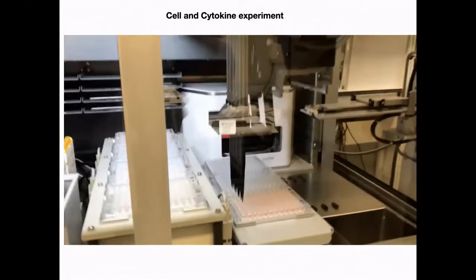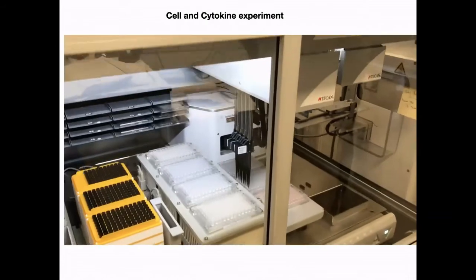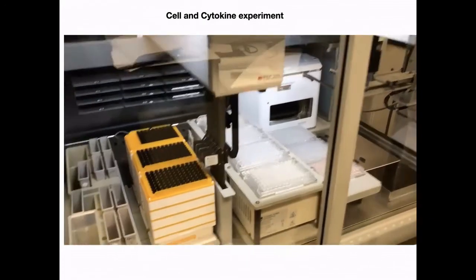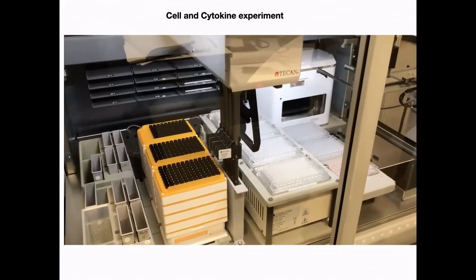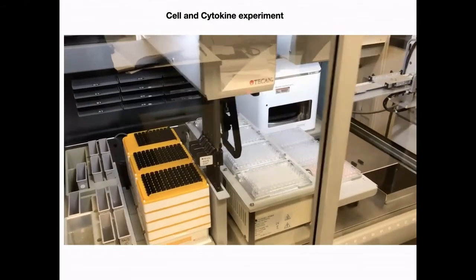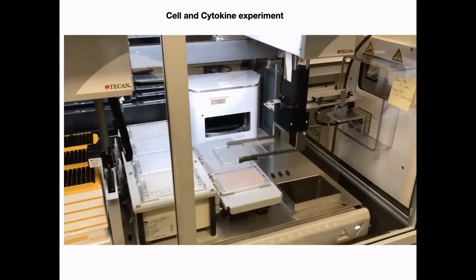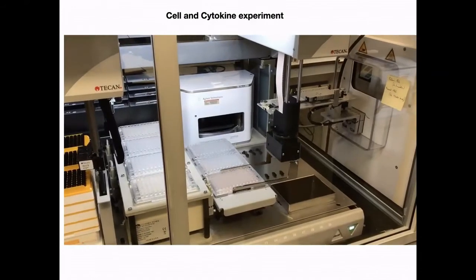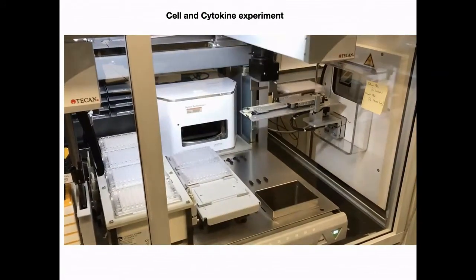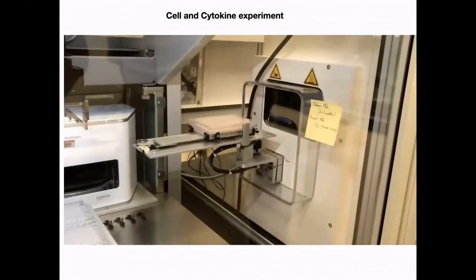And so the big advantage of this is that you prepare your experiments on the first day, and then you let it go automatically for roughly 1 week, say. It requires debugging and everything, but the advantage is that you can generate massive data over an extended period of time and get relatively precise measurements of everything that happens in this little test tube.